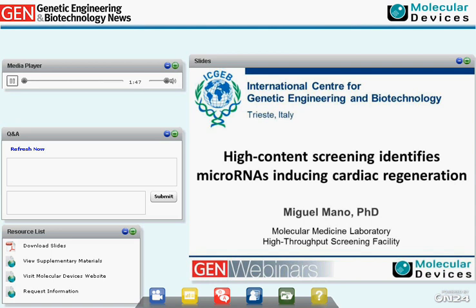My name is Miguel Mano, and today I will show you our recent work using high content screening to identify microRNAs inducing cardiac regeneration. So I work at the International Center for Genetic Engineering and Biotechnology, ICGEB, in Trieste, Italy, and I'm the person responsible for the high-throughput screening facility here.